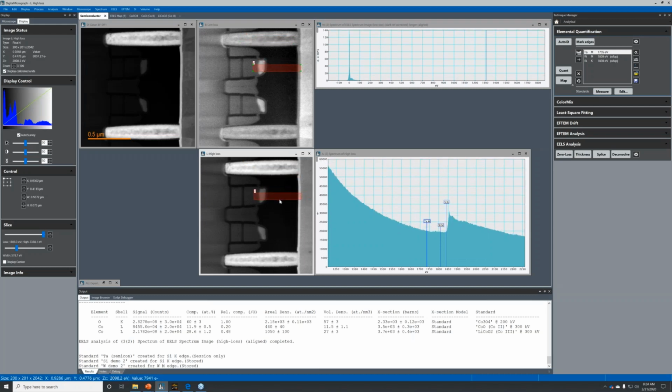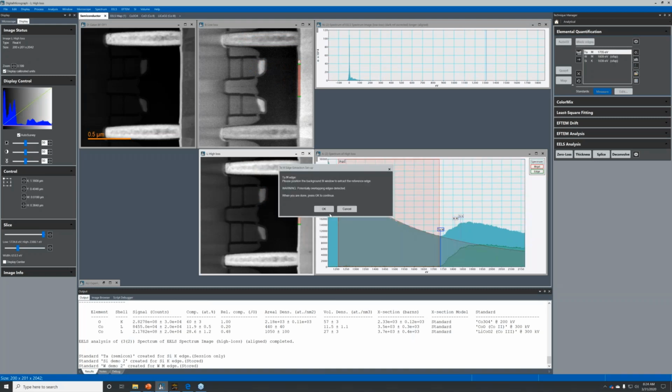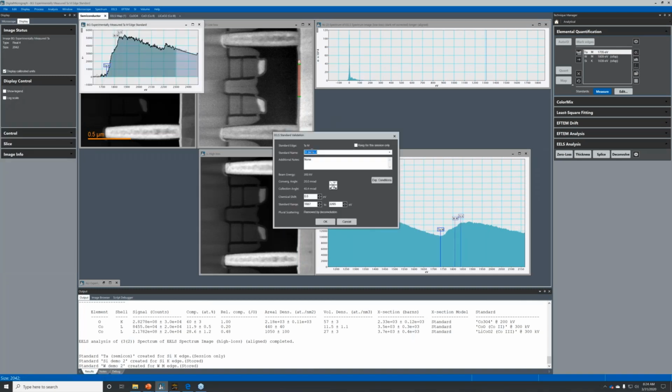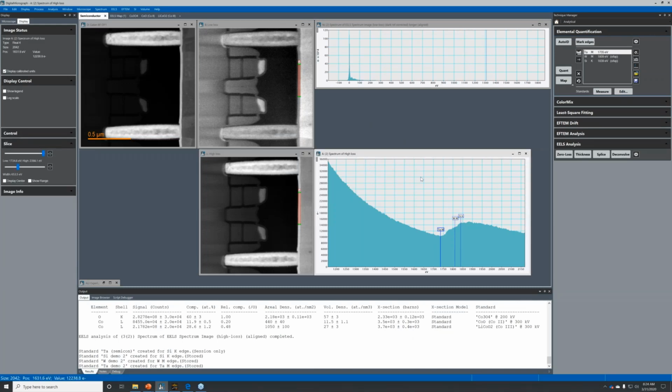The tantalum is actually this thin strip here. So we put our picker tool in the pure tantalum area. Choose the tantalum, hit measure. OK. Do you wish to perform the deconvolution? Yes. So you basically just build this library of standards. Okay, so once we've imported the standards, then we just do the quantification as we would normally do.